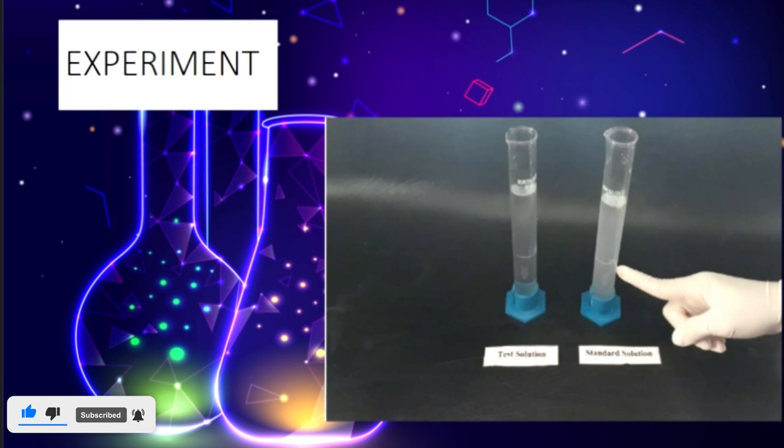Then you should add 5 ml of barium sulphate reagent. This barium sulphate reagent has barium chloride, sulphate-free alcohol and potassium sulphate. These reagents are added, and then we make up the volume with distilled water. Then we stir and leave it for 5 minutes for the reaction. But in chloride, we add the dilute nitric acid first, then we make up the volume.